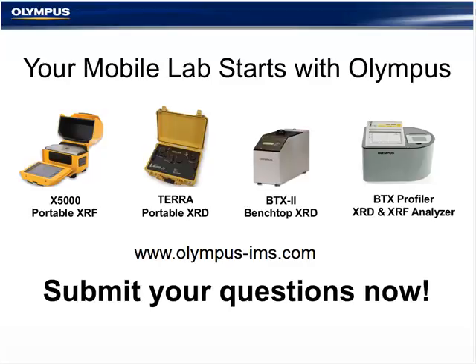Thank you. The next one is really a two-part question, so I'll answer the first part really quickly. Can you use Rietveld analysis with your instruments? Yes, our data output is accepted by all Rietveld refinement packages available in the market today. And the second part of the question is, do you think there is an advantage to using the Rietveld method with the data quality provided by the instrument after a 10-minute acquisition?